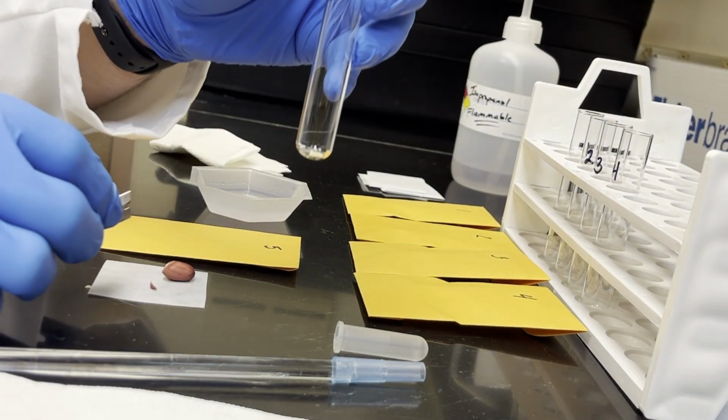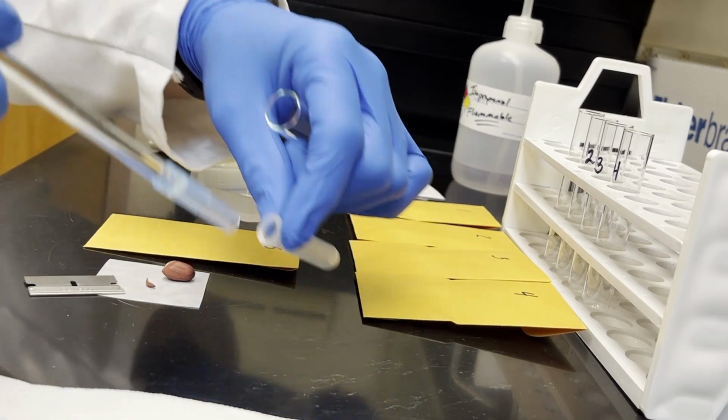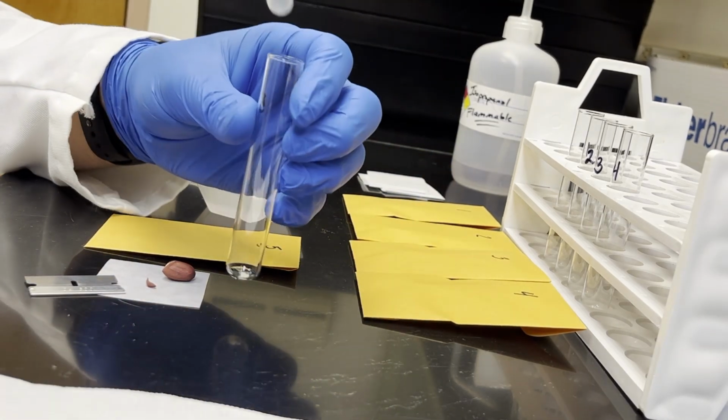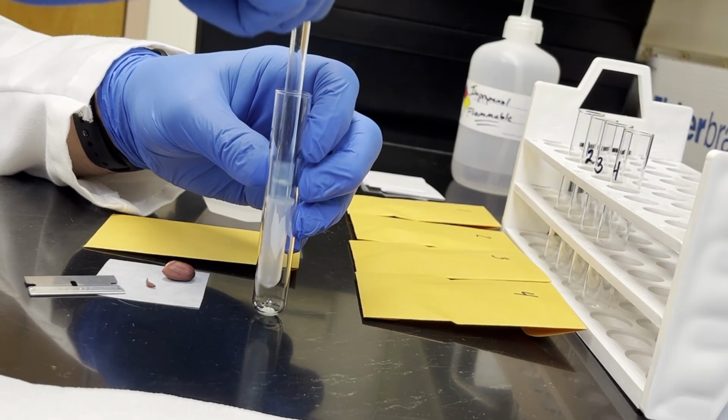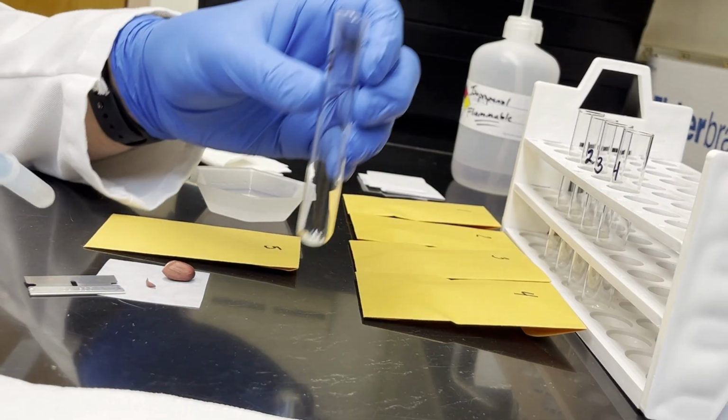It is placed into a glass tube and then ground using a disposable plastic tip. A separate tip is used for each sample, and the razor blade is cleaned between samples using alcohol to prevent cross-contamination.